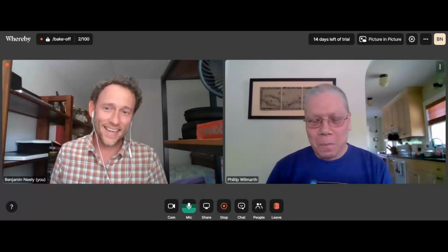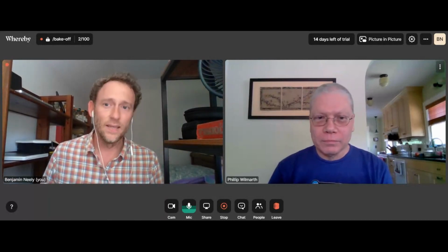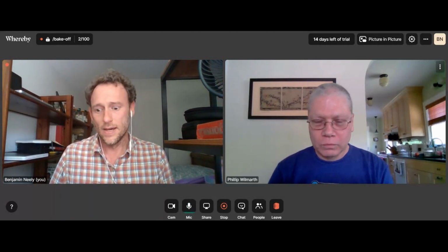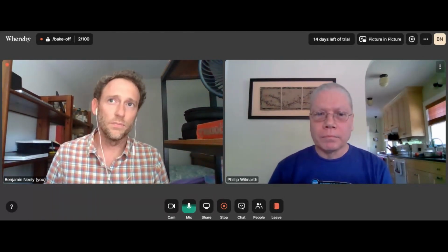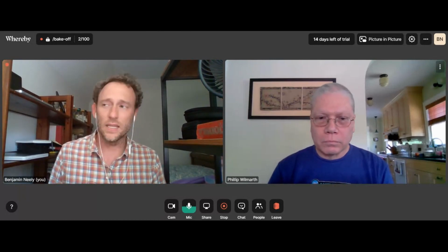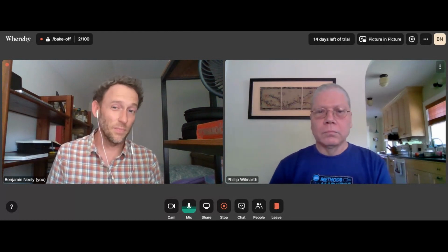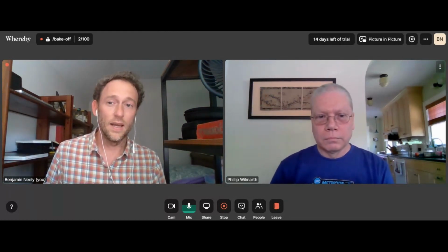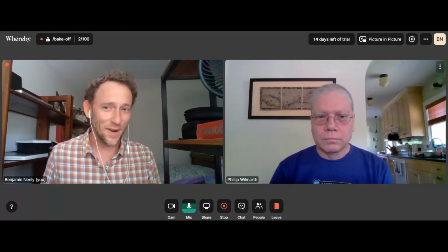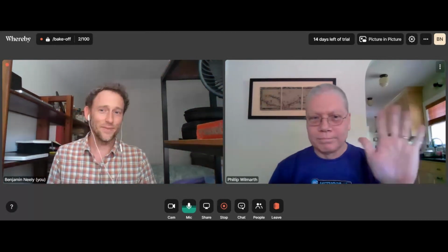And so for today, in our first kind of season, if you will, is looking at DDA label free quant, and this started off as the focus was grad students, but I think it's applicable more in general. And it's not just that we're going to learn how to use some tools, but we're also going to get to meet the people making the tools. And so for today, I'm not really joined, but across the country is Phil Wilmarth. And Phil, if you want to say some introductions.